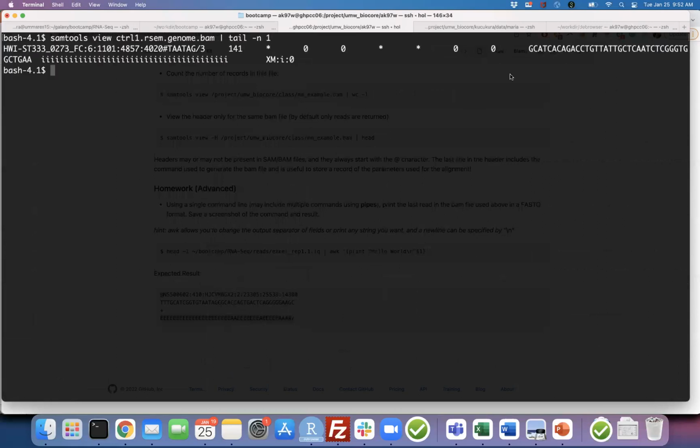Okay, so the read name is here. 1, 2, 3, 4, 5, 6, 7, 8, 9, 10 is my read. 11 is going to be my quality. So basically, you're just going to do this with awk.